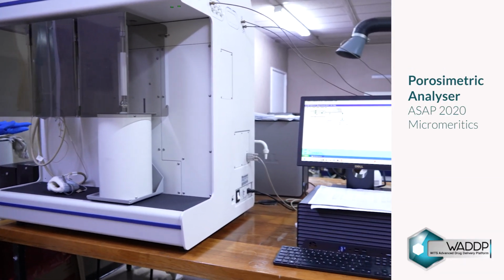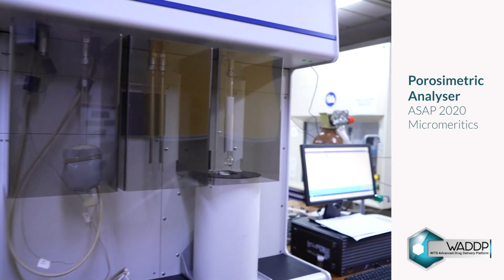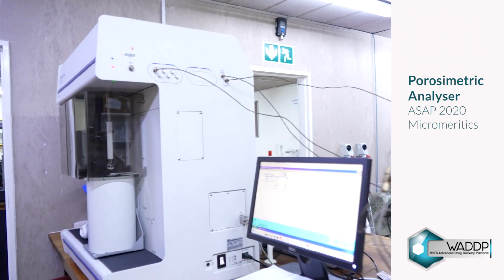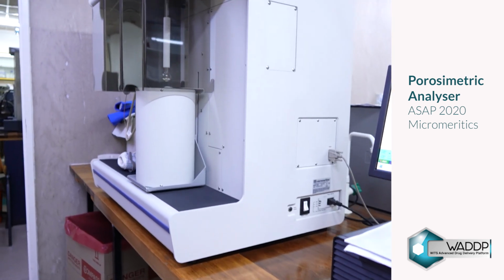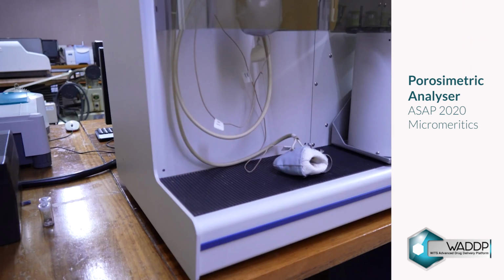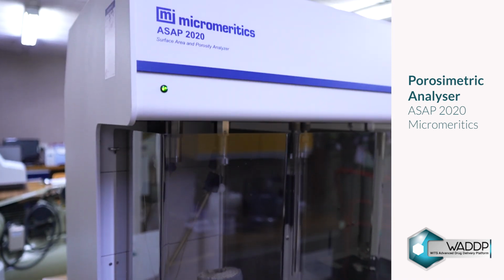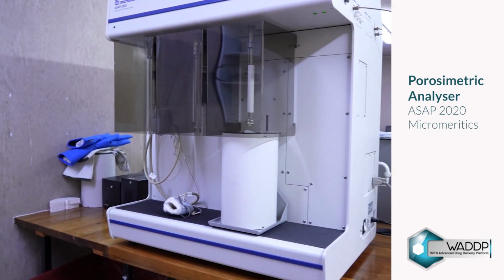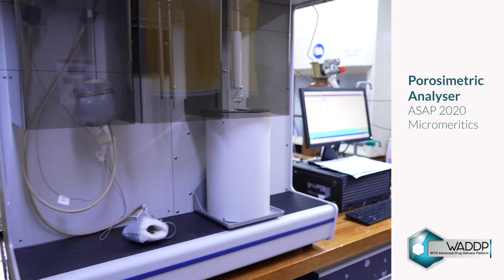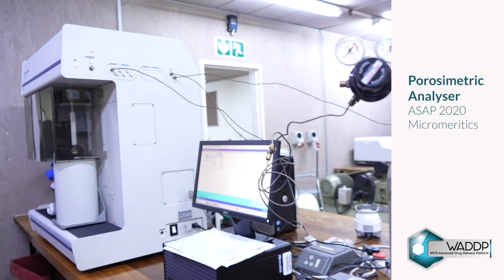The Micromeritics ASAP 2020 Accelerated Surface Area and Porosimetry System is used to determine the specific surface area, porosity, and pore size distribution of solid materials. It primarily utilizes gas sorption techniques, specifically physisorption, physical adsorption, and optionally chemisorption, chemical adsorption, to characterize materials.